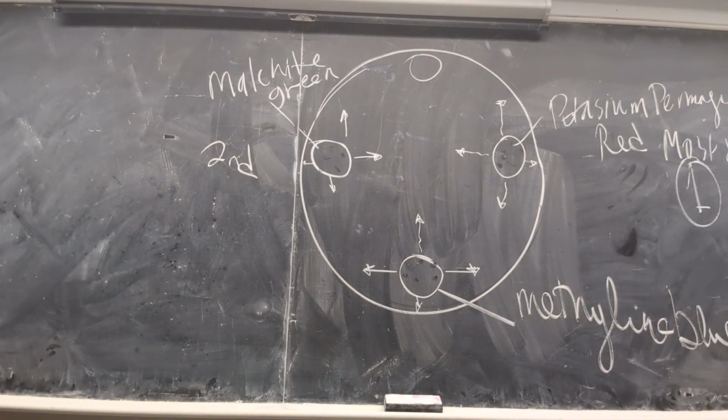What is the something very interesting that we're gonna find? I was gonna say they would all move to the top circle. Very interesting. Why do you think that? Because it has nothing there, so it's gonna move from high to low. Very nice. They're all gonna spread out from an area of high concentration to low concentration. Very good. But how is the picture gonna look?